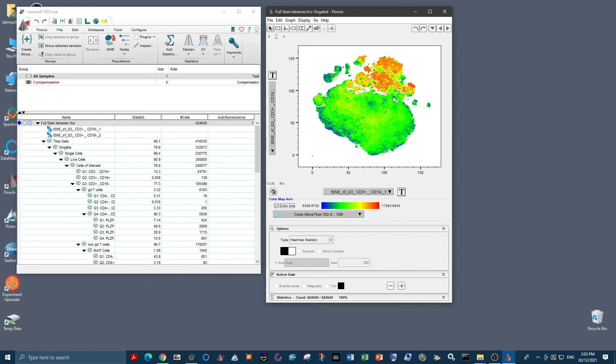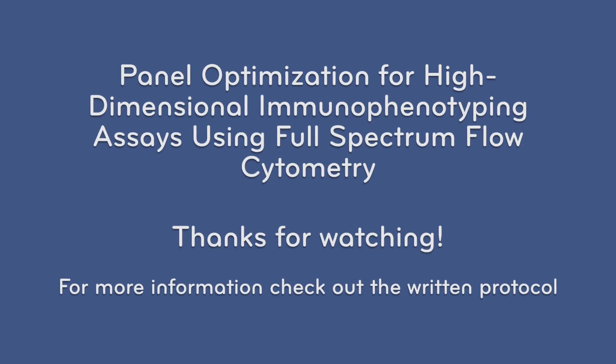And if we change this to CD8, we wouldn't expect co-localization, which is exactly what we see. And you just go through and iterate through different combinations of markers to make sure that they are co-localizing exactly where you'd expect them to, or not co-localizing where you wouldn't expect them to. And this way you can QC your panel.